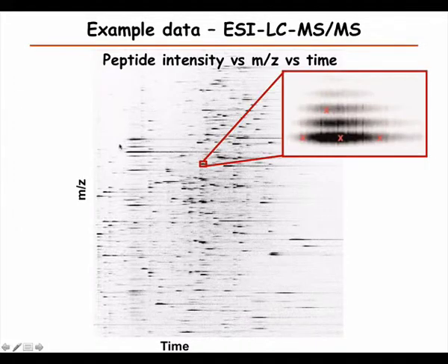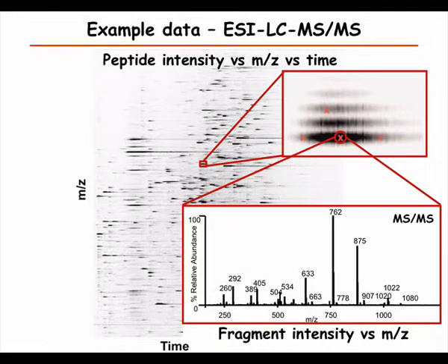If we zoom into one of these, we see that the peptide appears and then disappears, and then there is this pattern of the isotope. This is the isotope distribution that we'll look at closer later. And then at these x's is where the mass spectrometer has decided that it's going to collect and fragment that peak.